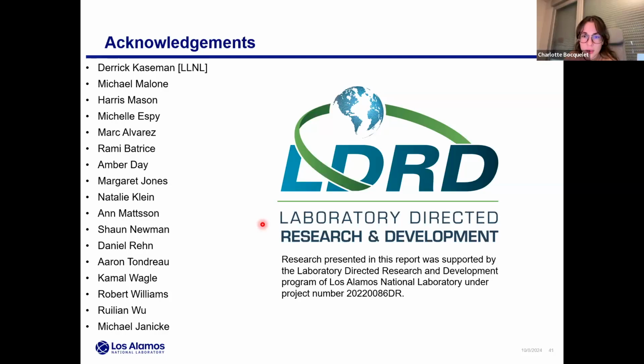Okay. I had one question regarding the spectra you show for the NQR or even for the Earth field. How much time does it take to acquire because you have a low field? So do you need multiple scans or is a few scans enough?